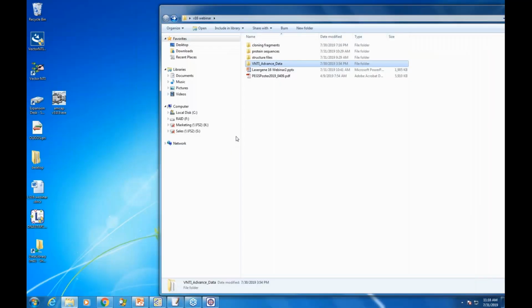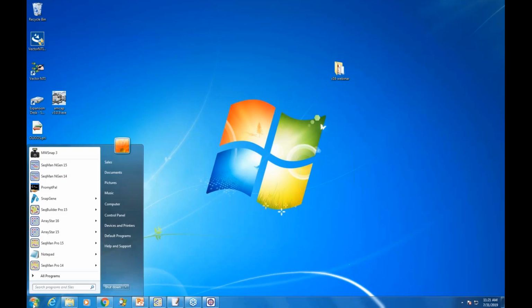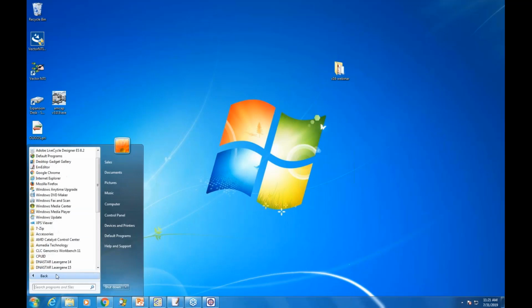So we're going to move on from Vector NTI to some of the new tools in PCR site-directed mutagenesis. Site-directed mutagenesis is one of those workflows that our current customers have been using Primer Select for in the past, and now it's Seq Builder Pro to design primers and introduce mutations. It's really a great program for doing that sort of work. And of course, for many years, people have used these programs because it's got such a nice interface.